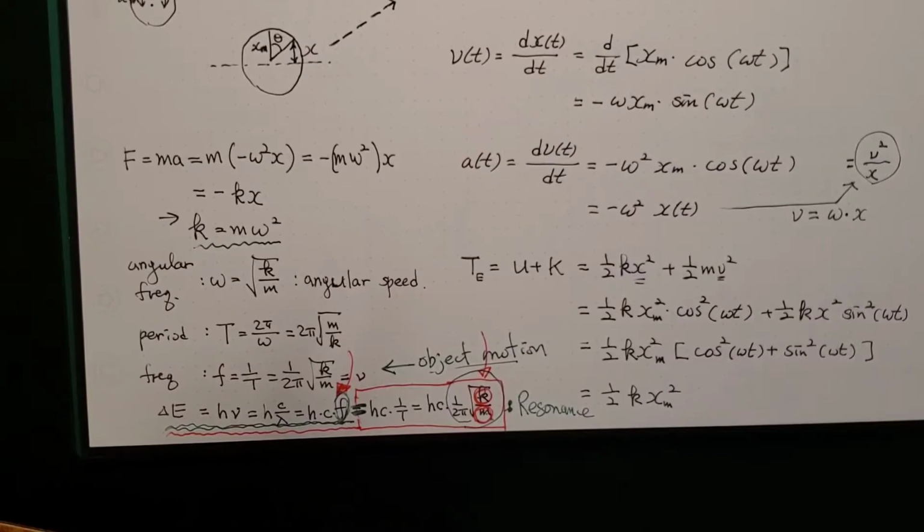Alright, with this slide that we used in the previous video, I want you to remember that in harmonic motion, like this oscillation in the IR that we try to detect, you need to have the physical model, the molecule, having a certain frequency, and we want to detect it, then our light should also have the same frequency.